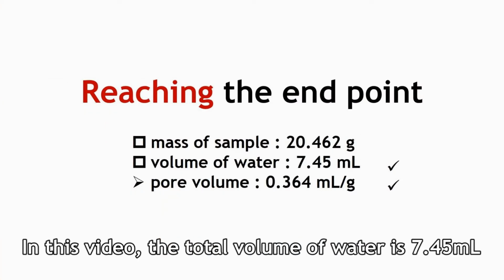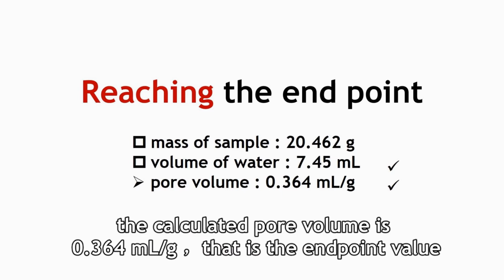In this video, the total volume of water is 7.45 ml. The calculated pore volume is 0.364. That is the endpoint value.